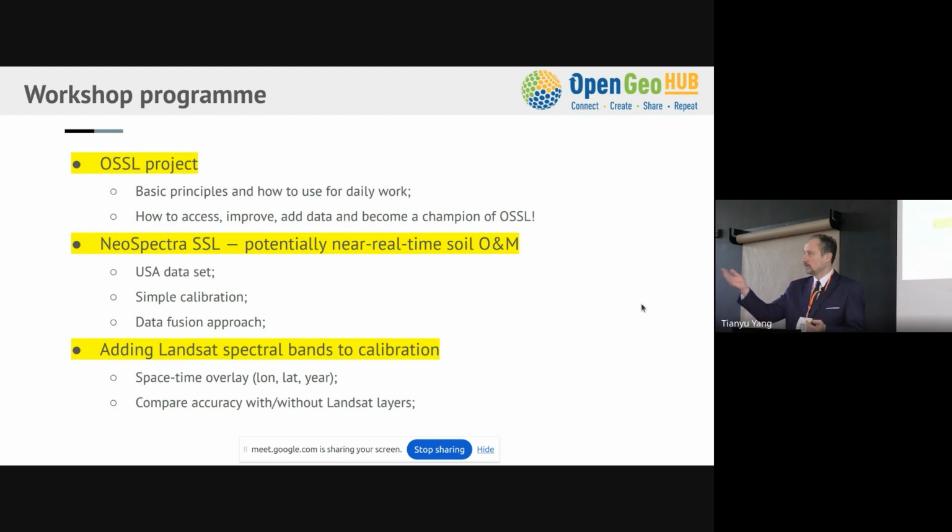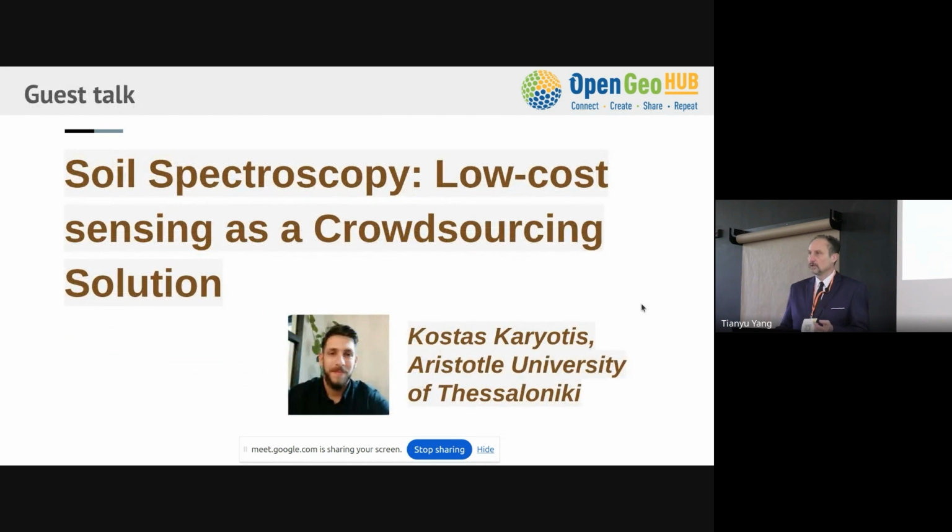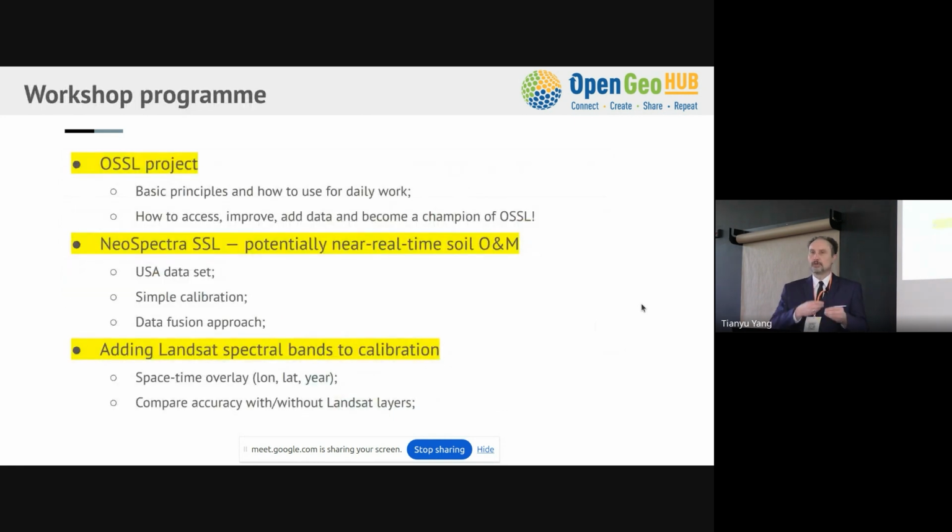But my colleague Kostas here is going to talk about the data from the AI4SoilHealth project. After I finish with the demo, I will pass it on to Kostas, and he will show you this data we also created in AI4SoilHealth. Although this data is still in processing, so it's still under the hub. While this data, I'm going to use this NeoSpectra Soil Spectral Library on OSSL. This data is really published, and you can use it, you can download it, you can test it.